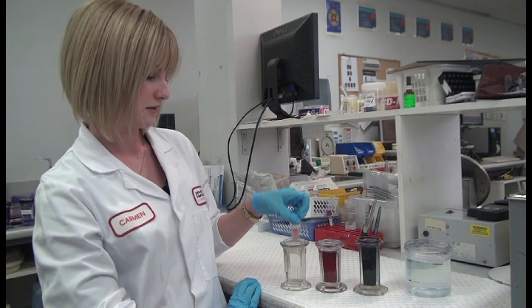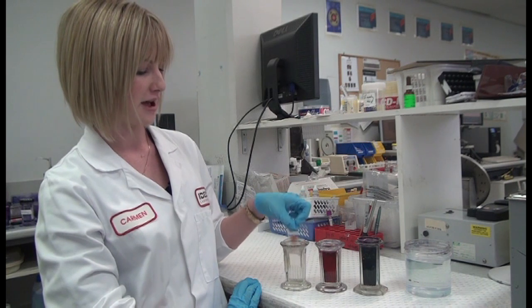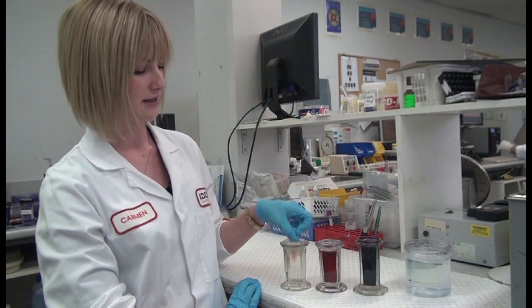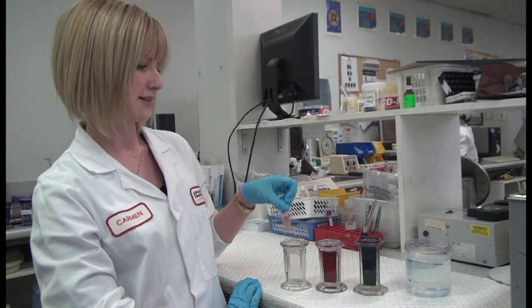One, two, three, four, five, six, seven, eight, nine, ten. Drain off the excess.